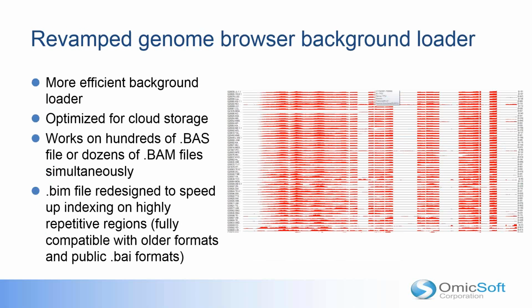On the visualization side for NGS, we spent quite some time making our widely popular genome browser even more efficient. We redesigned the background loading for the genome browser.